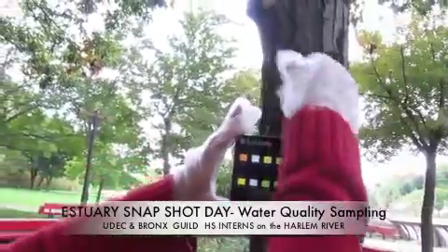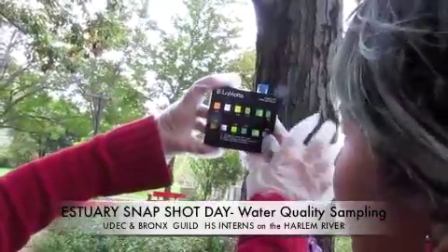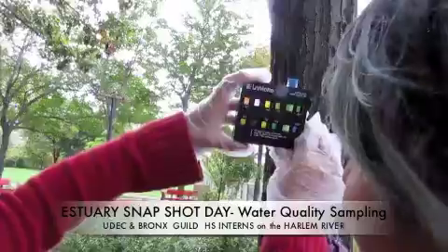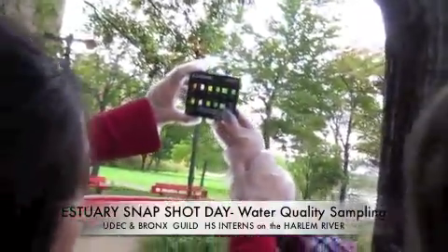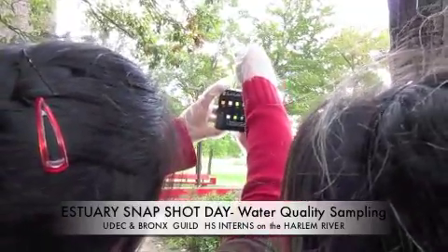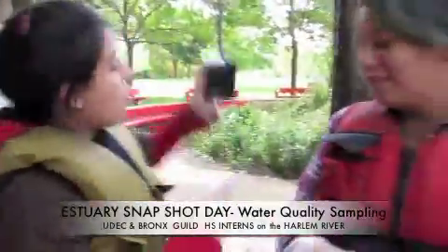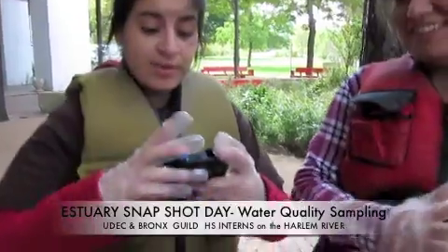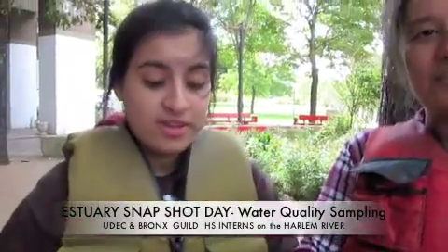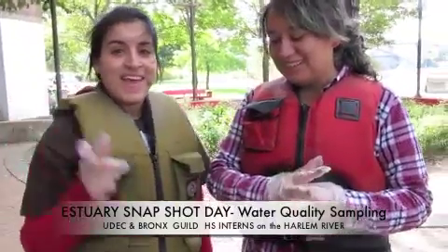It's 8. See, it's closest to the 8. Go to the sky, away from the tree. Do that again? 7.5. We've determined that the pH level in the Harlem River is 7.5. And that is the pH test.